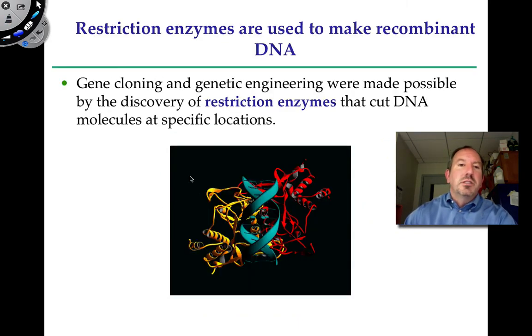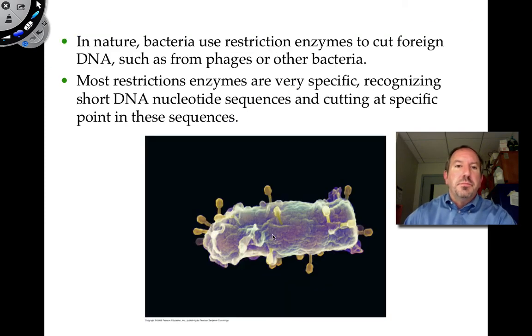And so how is it that we cut plasmids, and how do we put DNA into other? We use a special class of enzymes called restriction enzymes that cut DNA at specific locations. Where do we get these enzymes that cut DNA? It's a long, interesting story, but I won't go so far into it. But bacteria possess these enzymes to cut DNA.